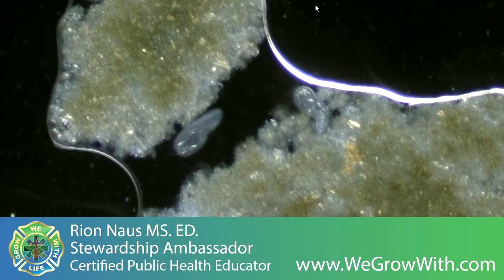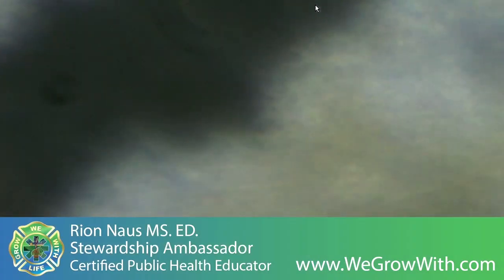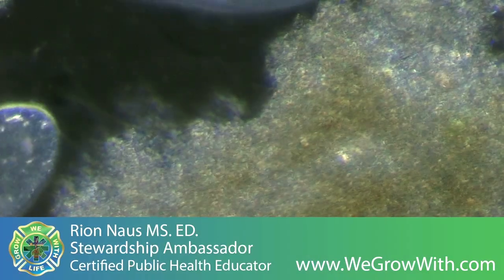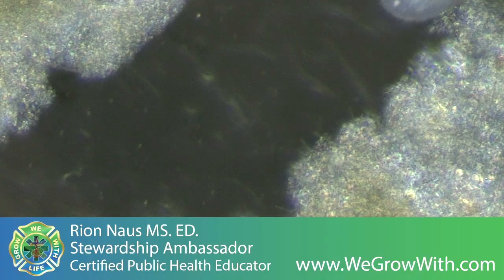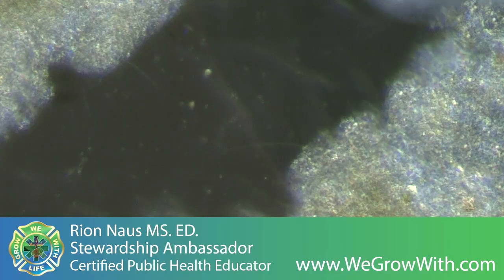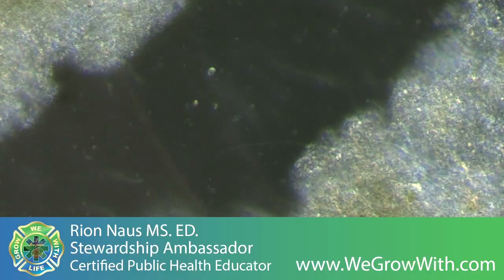And if we go to 400, you can see how that aggregation is filled with bacteria and different minerals.